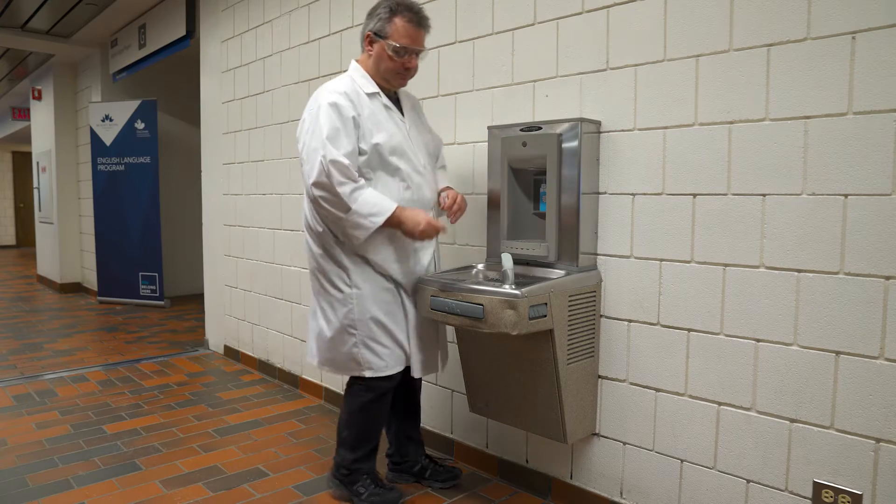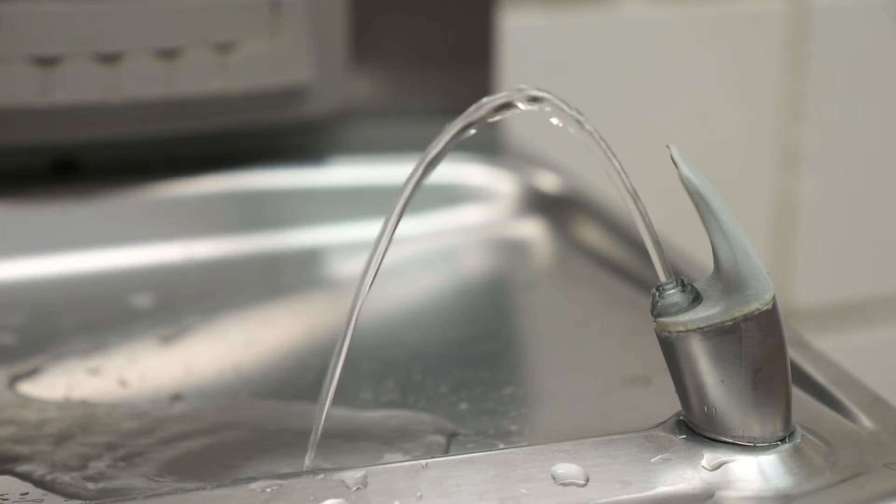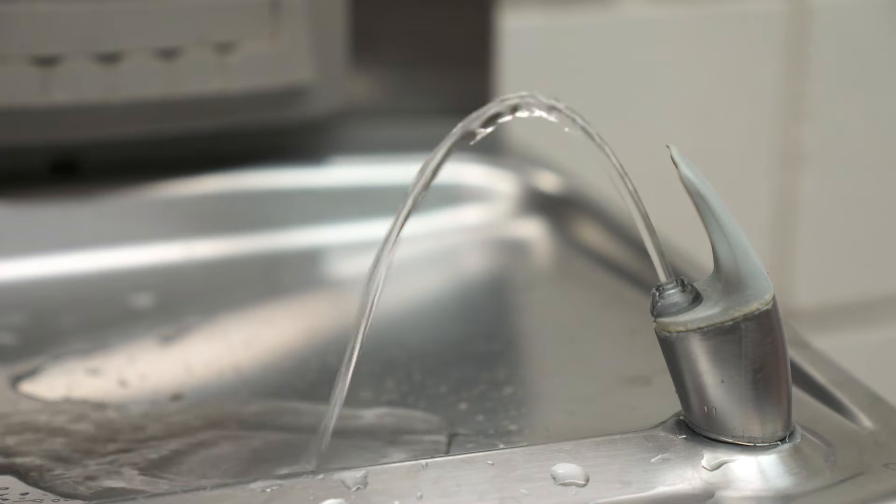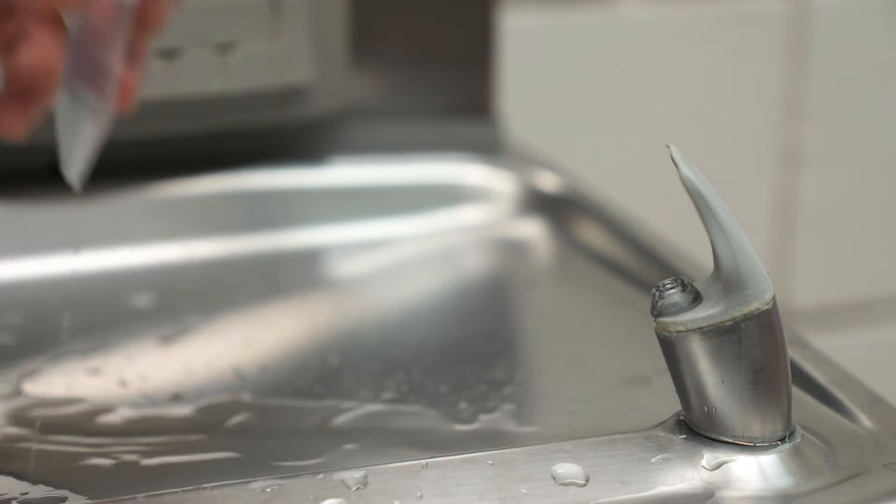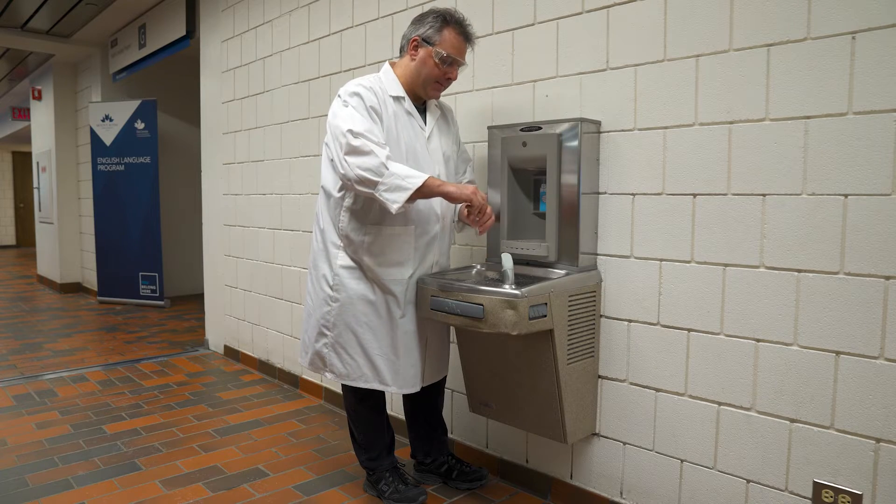To get a flowing water sample, what we asked you to do was to run the water fountains for at least 30 seconds before you took your water sample. We prefer to use flowing samples because they are a better representation of what you would normally drink at your school.